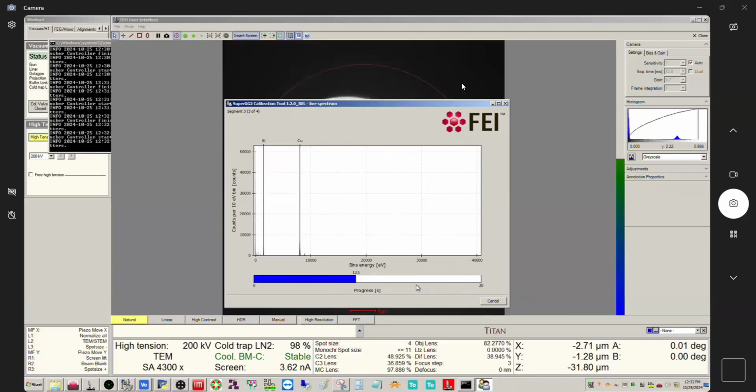So it's very interesting. I guess it doesn't have to do this for each dispersion, which is interesting. It's just doing this once and somehow it's applying equally for every dispersion. When we're done, we can go back and do some test acquisitions and make sure that our results are accurate, which is always a good idea to do.